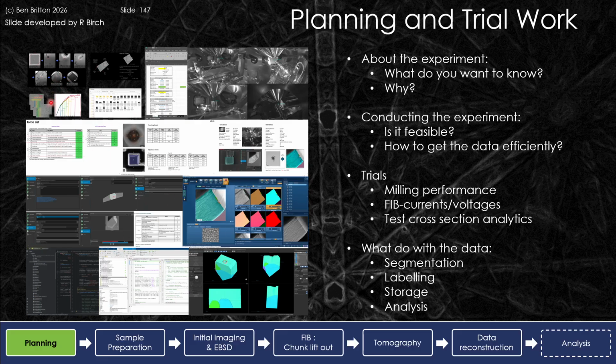This indentation was done by Shuheng Li. And so we have a number of indents that were performed. We selected the correct indent to analyze. We did some EBSD data to verify the site-specific area. We calculated how much time it would take for the EBSD mapping. And we checked the sample could EBSD and produce beautiful diffraction patterns, etc. from our surface, so we could validate what was being done. Produced a series of to-do lists that could go through.